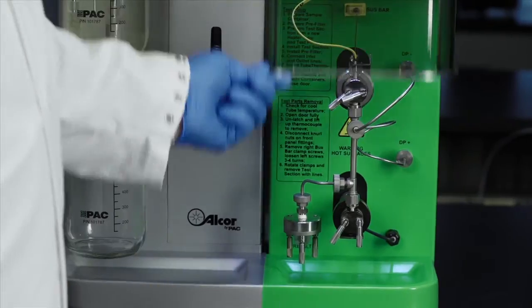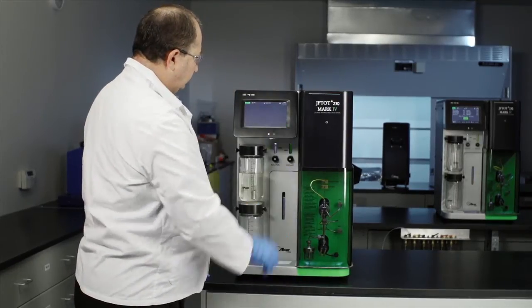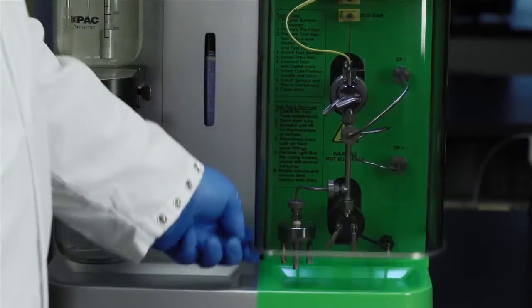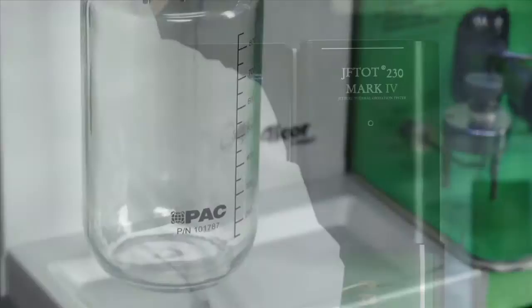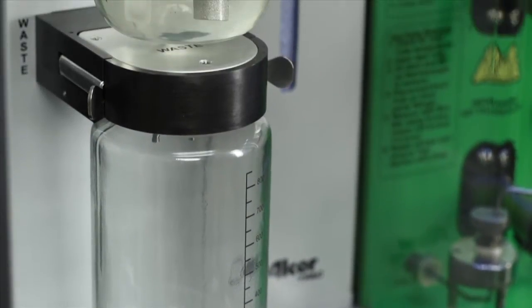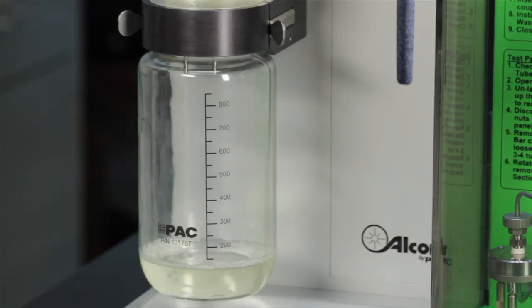The sliding test area door prevents exposure to the hot test section. Tests won't start until the door is closed, and the risk of Jet Fuel Exposure is further reduced when the Jephtot 4 automatically flushes fuel out of the test section lines at the end of the test. This keeps the test area and the front of the instrument dry.